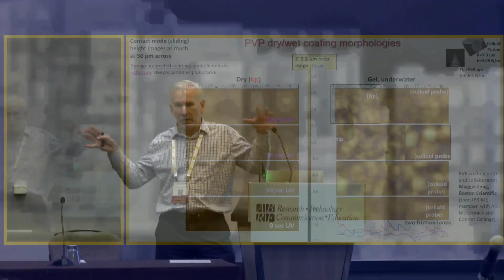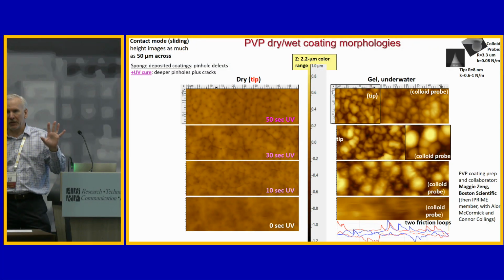I have the same problem. We have lots of people that want to get these kinds of results, but hardly anybody wants to get trained to do it themselves. And I think that's part of what's behind companies like you mentioned, is that they try to produce something that the average person who doesn't want to spend months getting trained and become an expert on a conventional AFM can do with a more narrow targeted measurement.